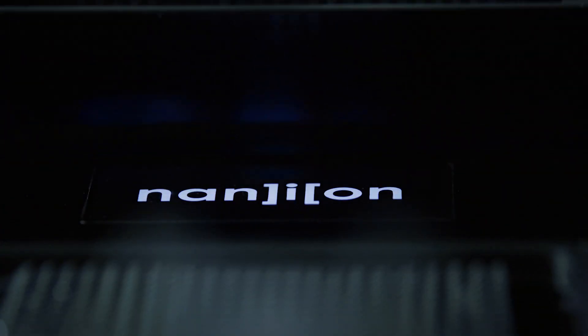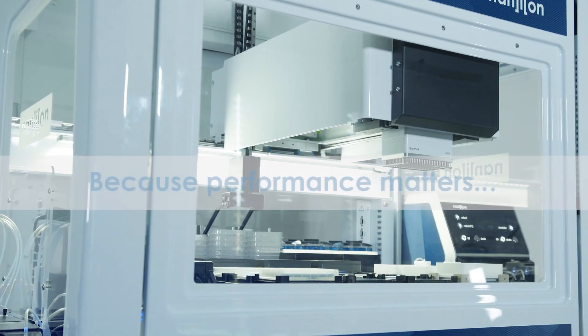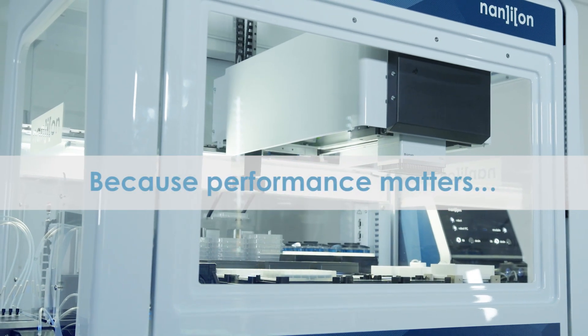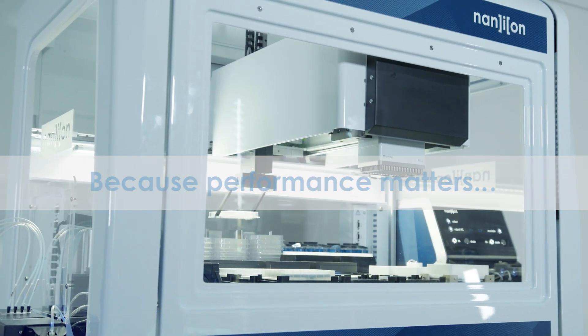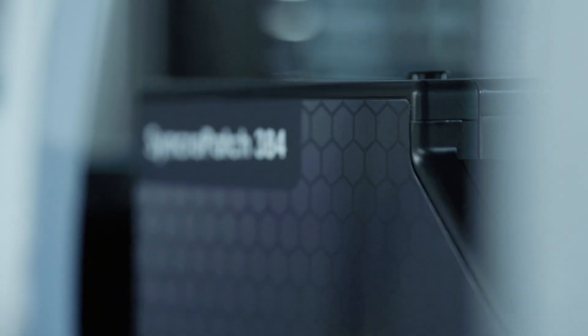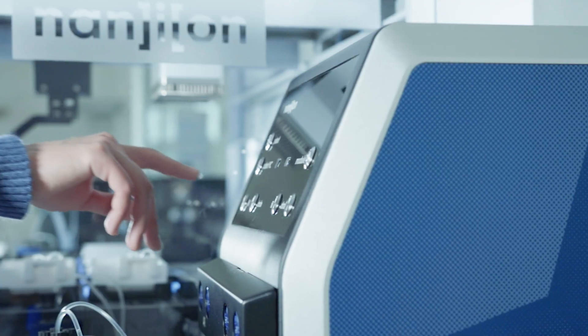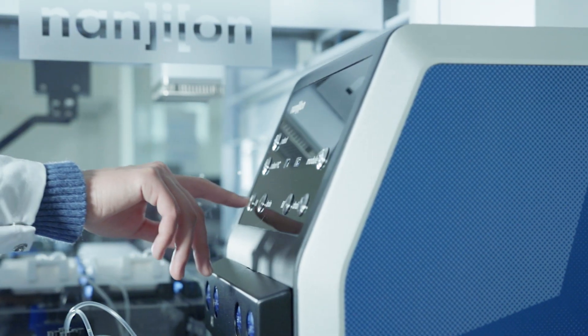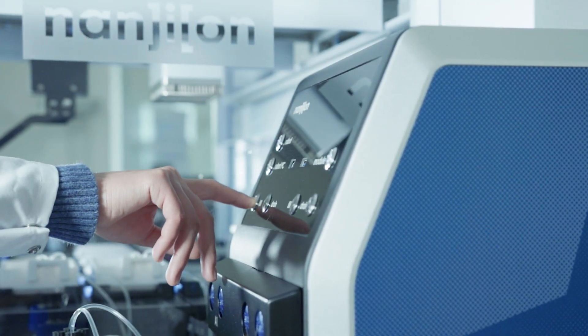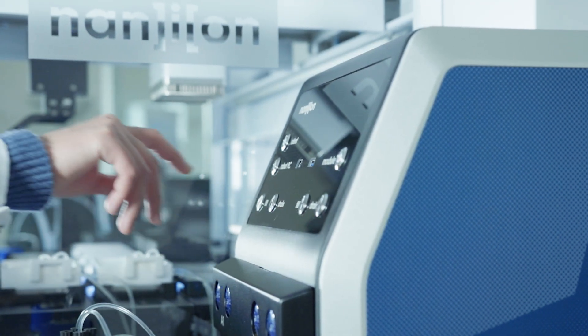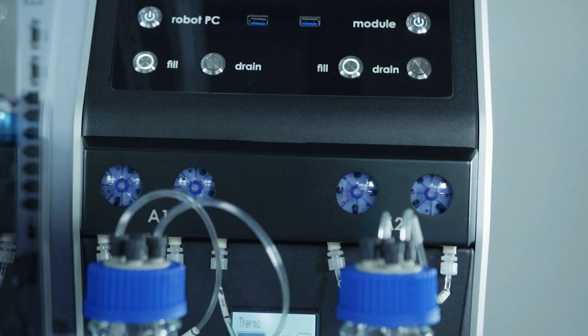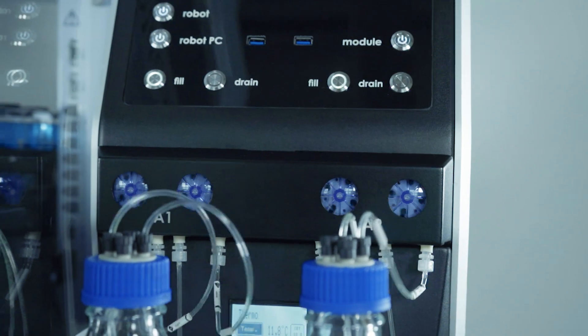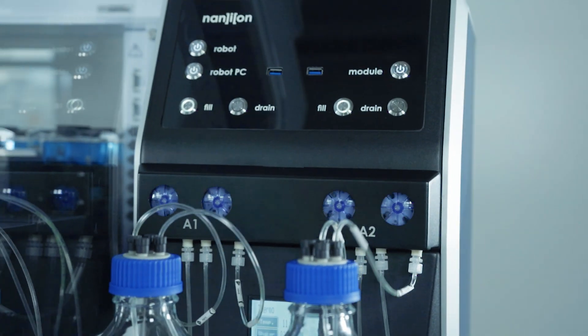We love the new SyncroPatch 384, here's why. We have listened to the latest demands from industry and taken onboard feedback from our users to bring you our most innovative automated patch clamp device yet.